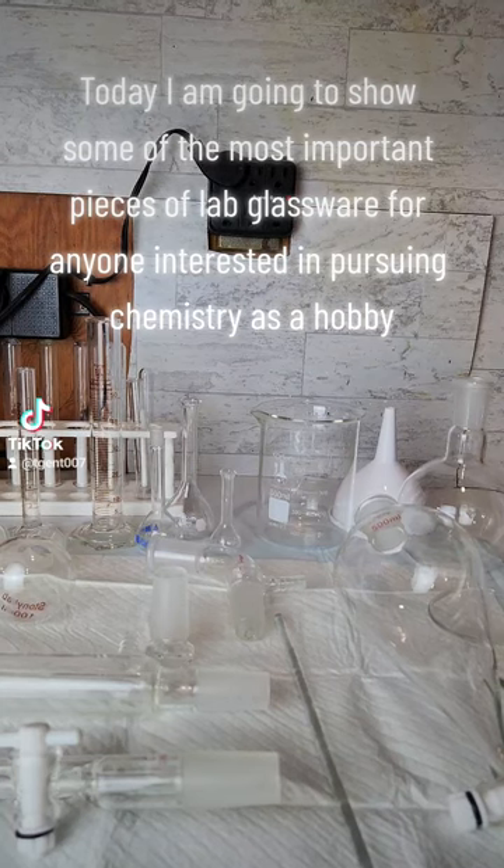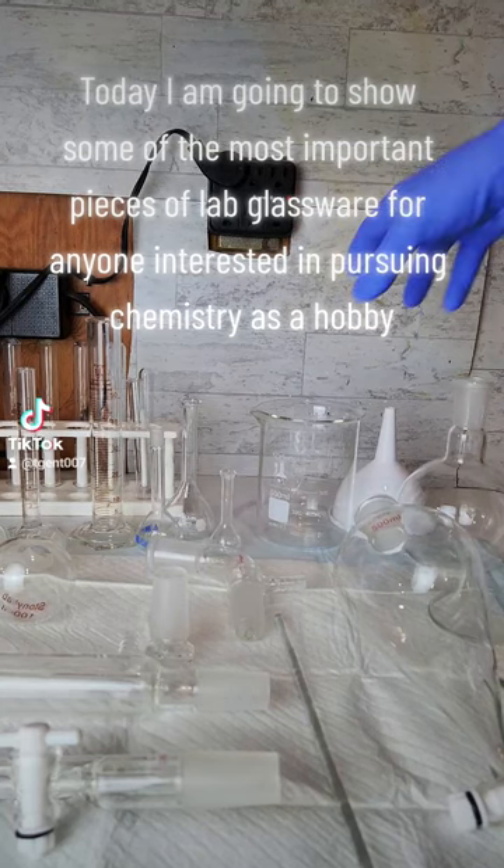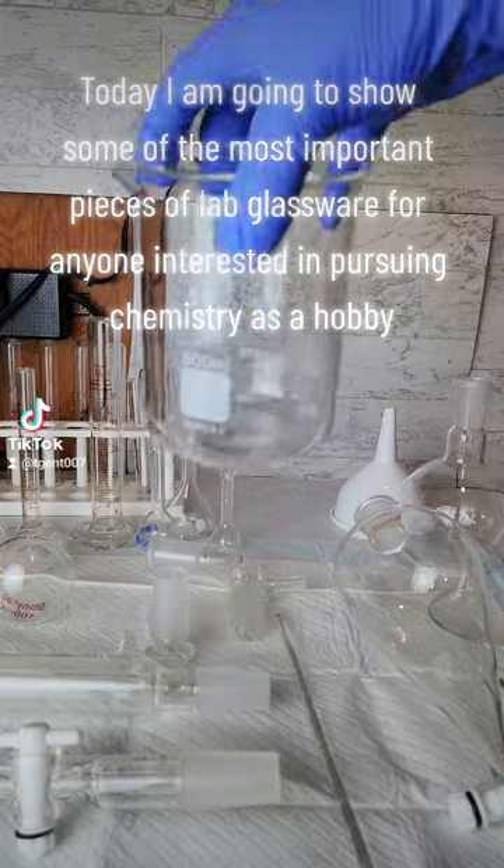Today I am going to show some of the most important pieces of lab glassware for anyone interested in pursuing chemistry as a hobby.